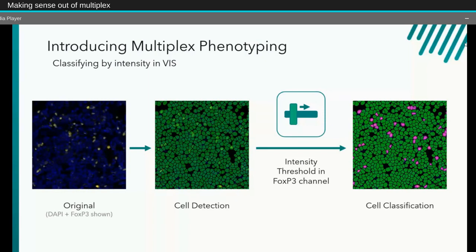At this point, for instance, counting the number of cells, looking at the distance apart from each other, or looking at other characteristics. Now, this is fairly trivial with a single marker, but what about the example we had before? In this case, three different markers, the green, magenta, and pink and blue from the first example.